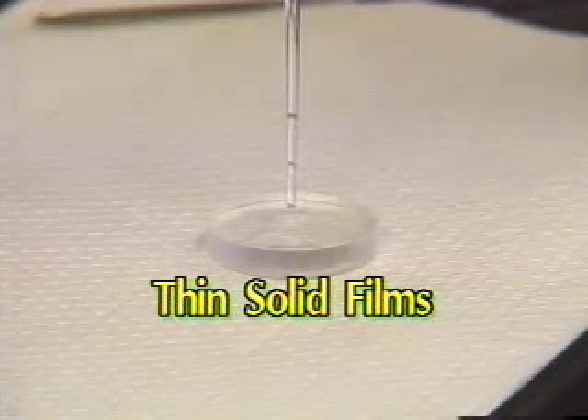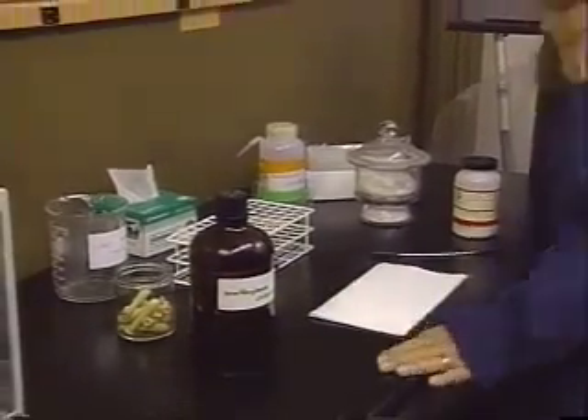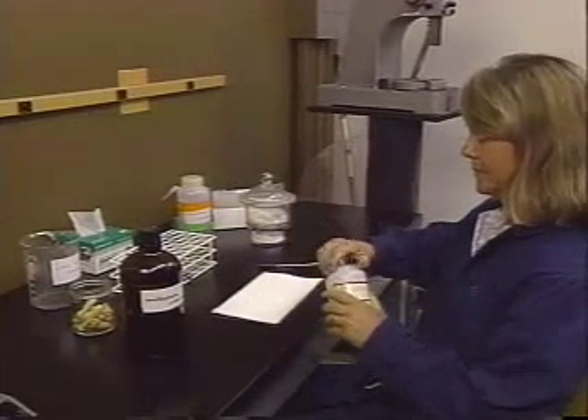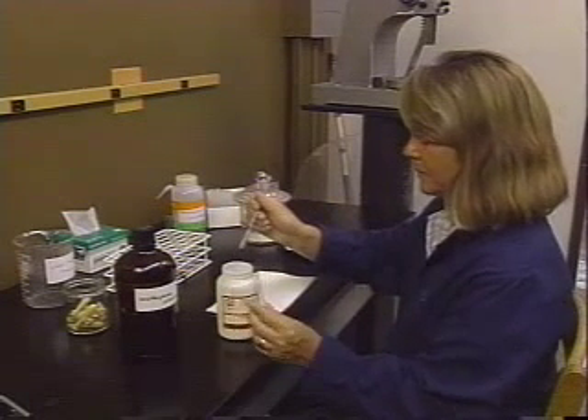Part 2: Thin Solid Films. Thin solid films are prepared in a manner similar to liquid films. Although the method does not work for all organic solids, we have found that it works for most of the products which you will isolate in this organic laboratory course.